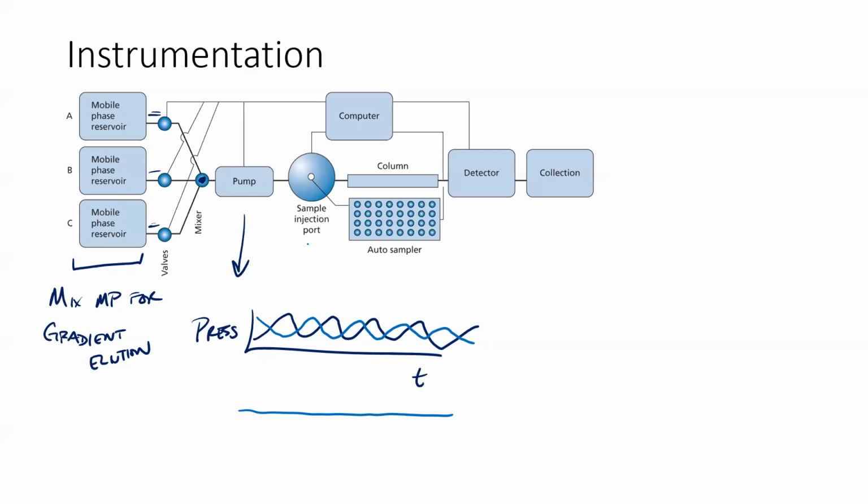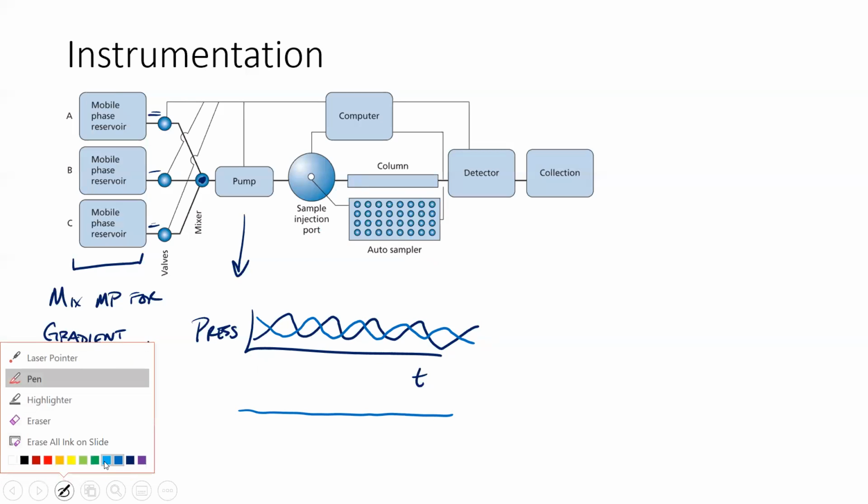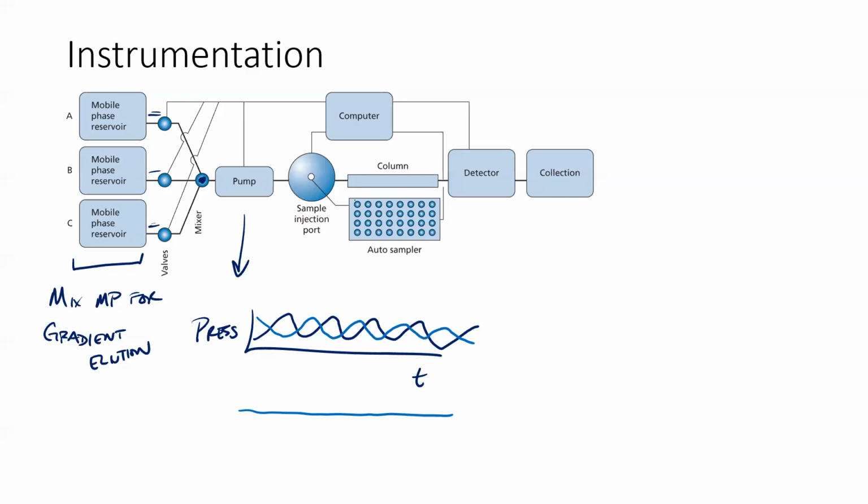This sample injection port we'll talk about on the next slide, right? And the auto sampler, that's something that some have and some don't. The column is often enclosed.